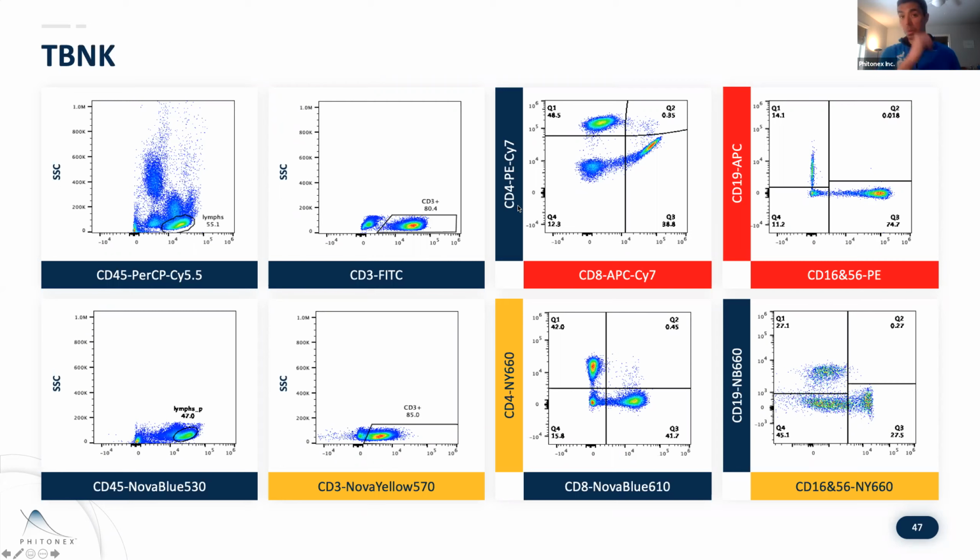This is commercially ordered and fresh, from the vendor. So that's a pretty nasty little compensation issue. And then really where it's going to get pushed, of course, is CD16 and 56, right? Because we're up against PE, which is actually able to pull apart these populations and do it reasonably well.